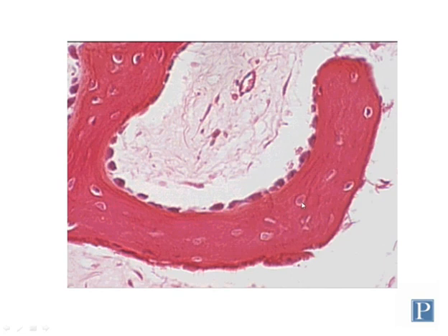In addition to the osteocytes within the lacunae, there's a different type of cell that you can see that sits on top of the trabecular bone. Because this bone is in the process of being developed, you can see the osteoblasts, which are laying down the bone. So these cells, again, are called osteoblasts, and they always sit on top of the surface of the trabecular bone. Osteocytes are trapped within lacunae, both in trabecular and in compact bone.